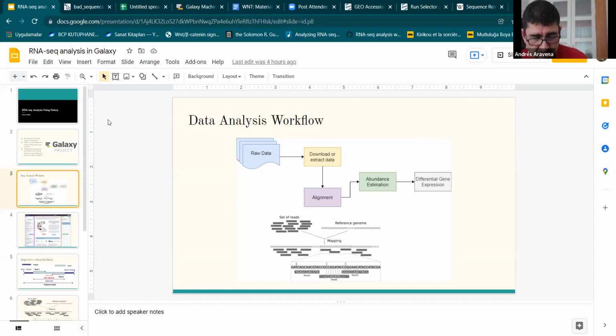As you say, there may be two objects that we are calling by one name. In this case, we care about the gene, not about the different transcripts. So there is only this marginal case that we may have some reads that did not map because they contain the intron, let's say. That may happen, and I don't know how much it happened, but my guess is it's not a big percentage.